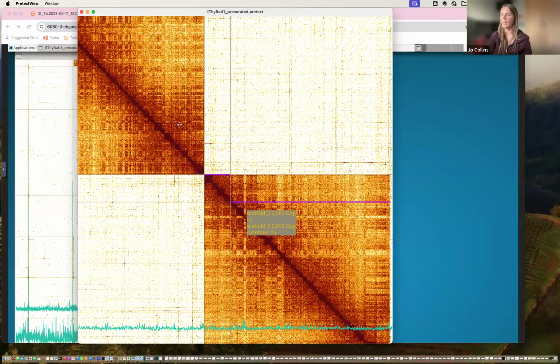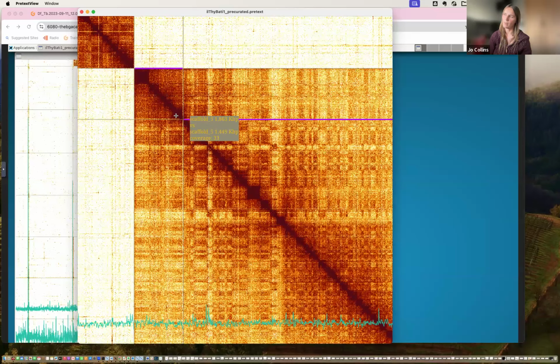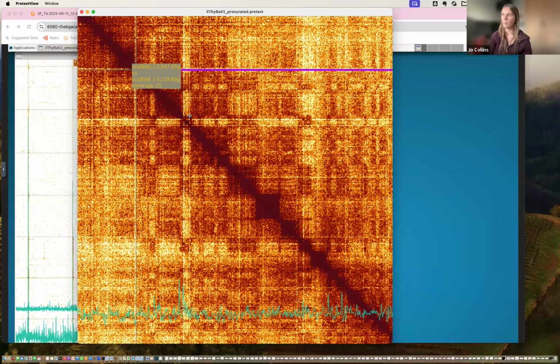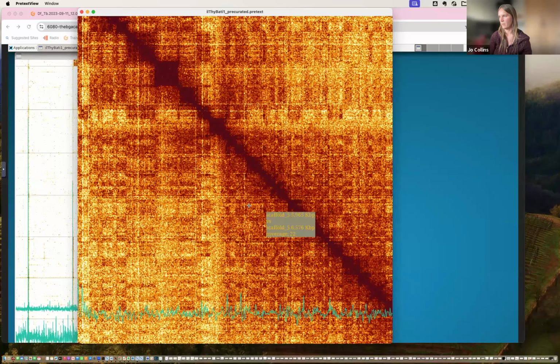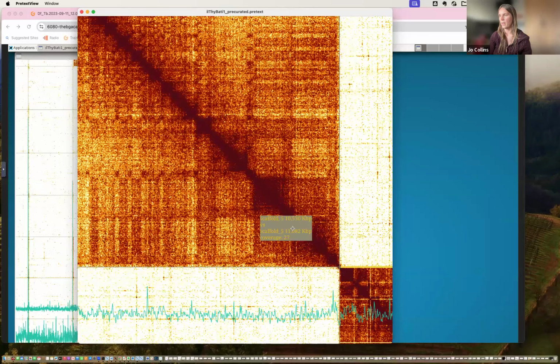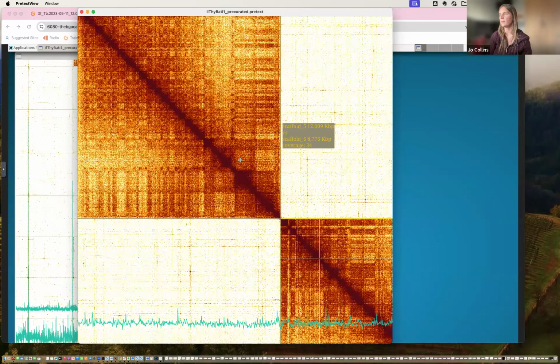from where we were. We've taken out that piece of chromosome that doesn't belong there, and we're now going back through the rest of the chromosome to make sure that we're happy with the assembly that we've got. So that all looks okay. We've got telomere on the end. We don't appear to have anything else that goes in.